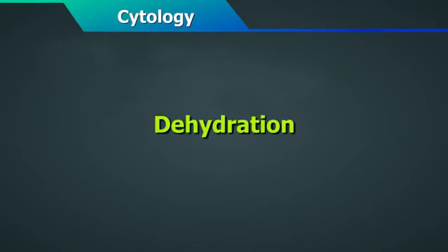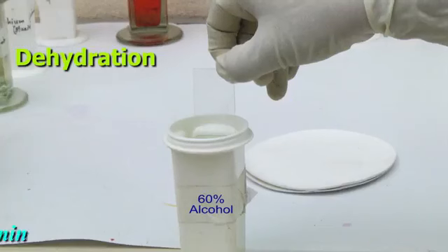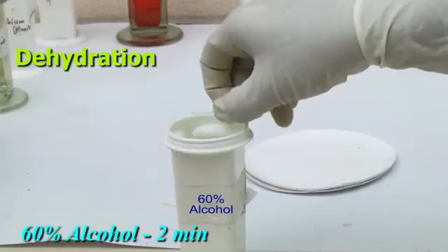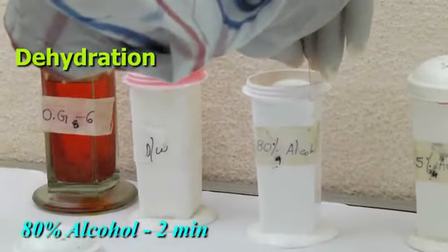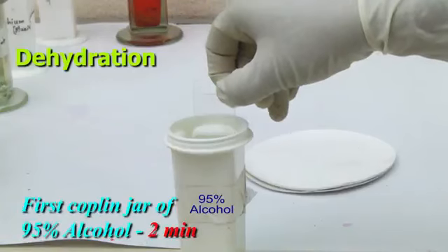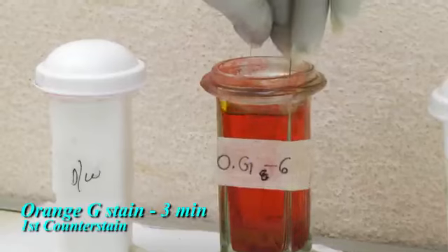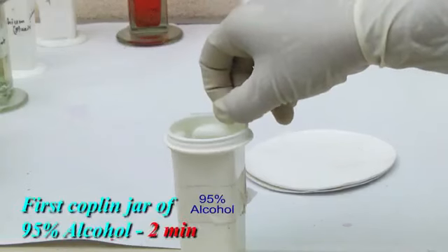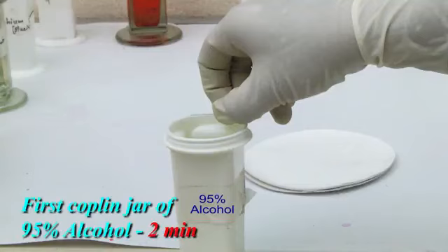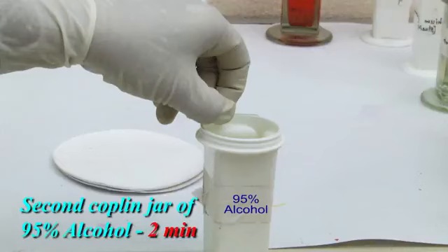Dehydration in 4 steps. Distilled water, 3 minutes. 60% alcohol, 2 minutes. 80% alcohol, 2 minutes. 95% alcohol, 2 minutes. Orange G stain, 3 minutes. Dip in the first Coplin jar of 95% alcohol for 2 minutes. And again dip in the second Coplin jar of 95% alcohol for 2 minutes.